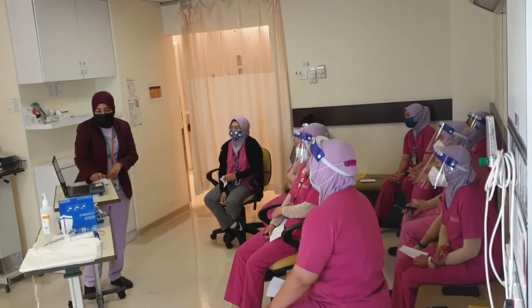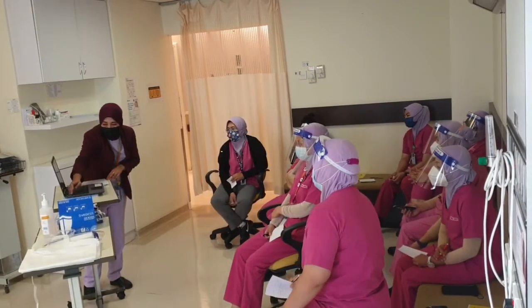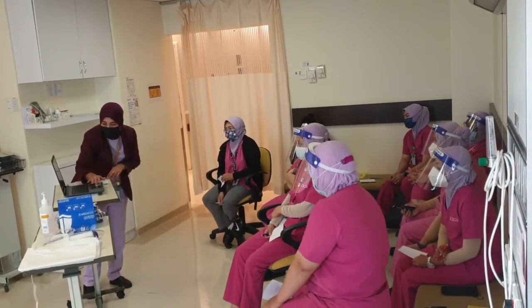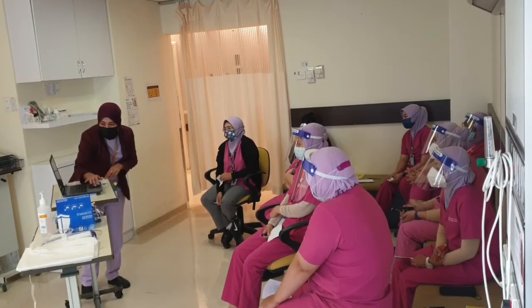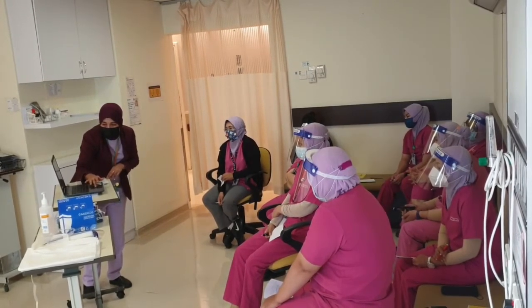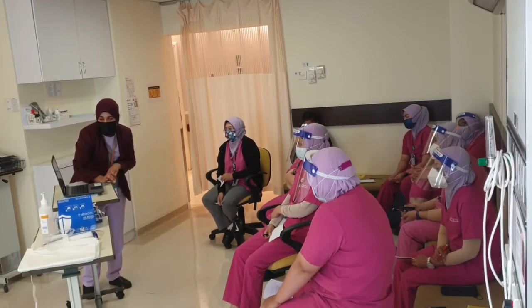So now I will show you the video of how to do the proper donning and doffing.